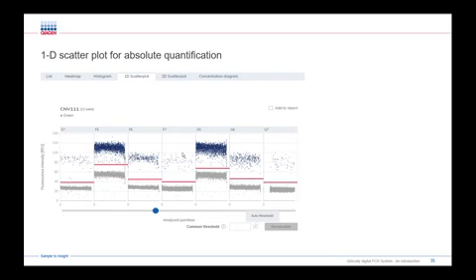Once the dotted line is in the appropriate spot, click the chart, and the line will become solid and the threshold value is updated and displayed in the threshold field. In addition to moving the line, you also can directly edit the value in the threshold box. To apply the new value on the data, click Recalculate to trigger the recalculation of results.